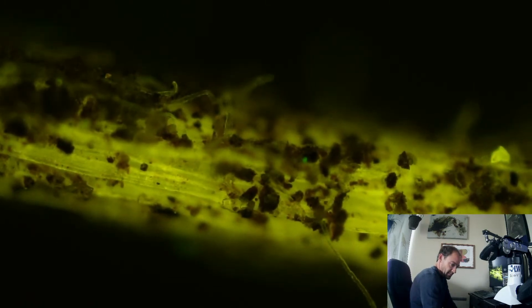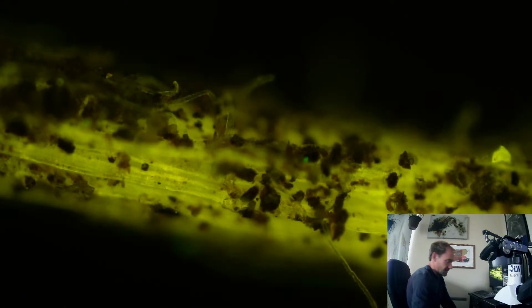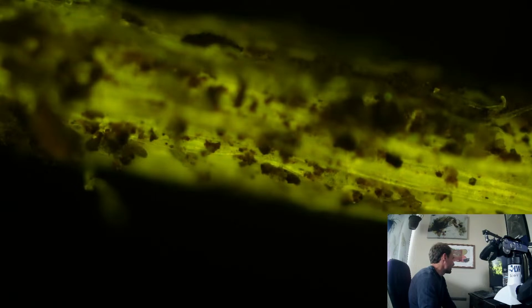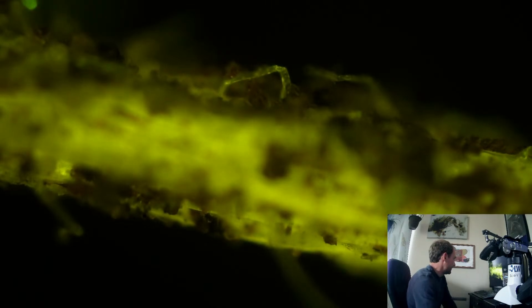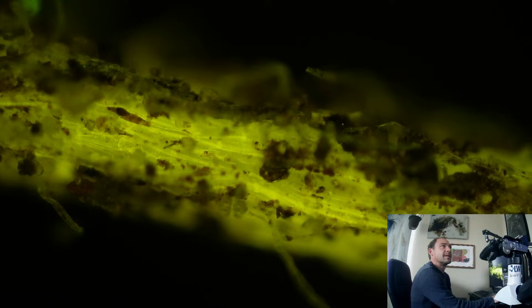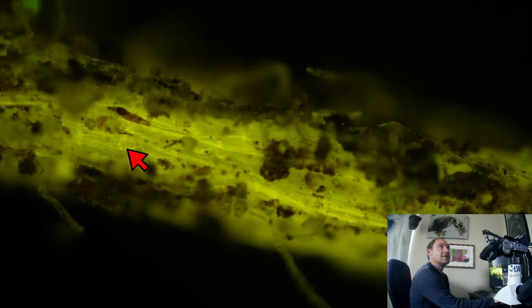Picture. Oh. Close this aperture. Yeah, it doesn't matter much. And let's see if we can find anything else glowing really bright. Yeah, we're seeing some right in over there. That looks like some glowing hyphae.